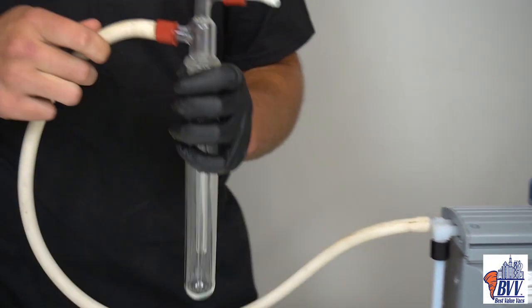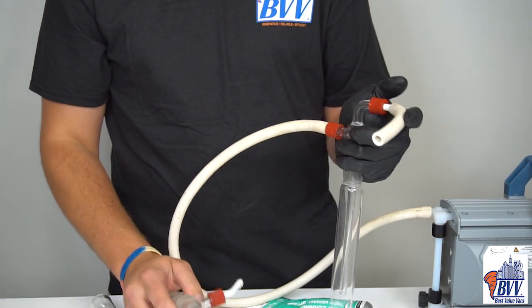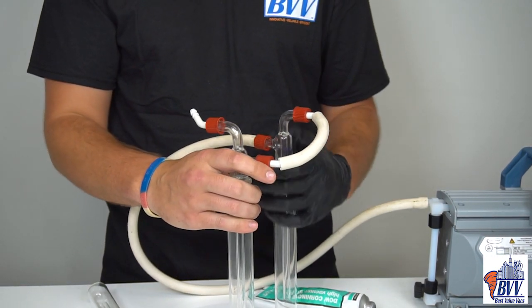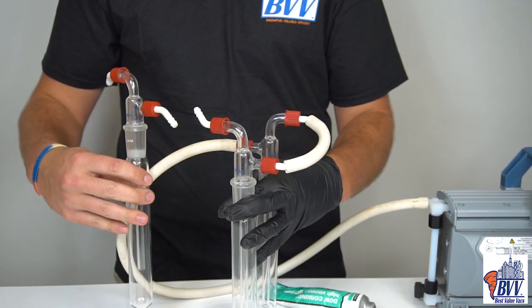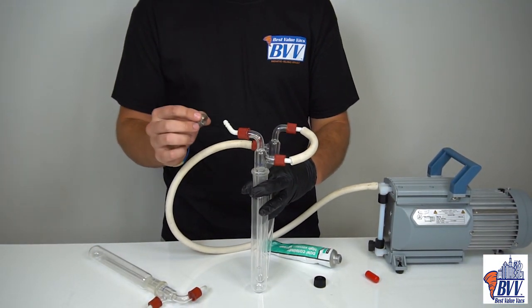And then when you're going cold trap to cold trap, it's easier to use short lengths of gum rubber and these bent barbs. So the top end of one cold trap goes to the bottom end of another, and it's going to go like that into a circle, assuming you have 3 cold traps. If you just have 2, this one will go to the system, or else you can put this third one in between that. If your fittings are very loose, you can use a hose clamp like this.